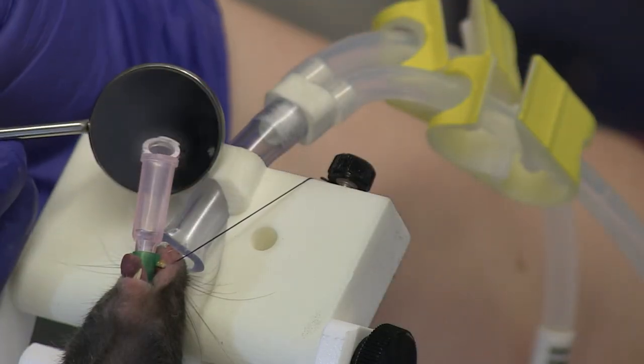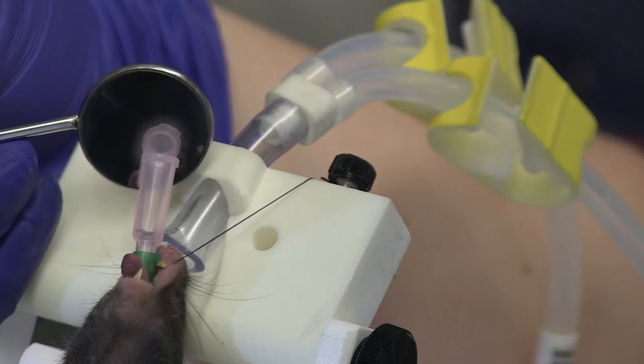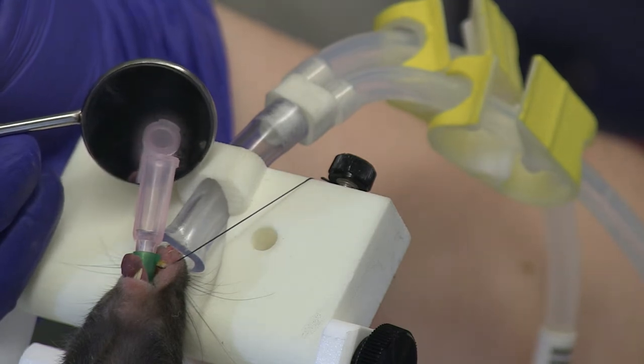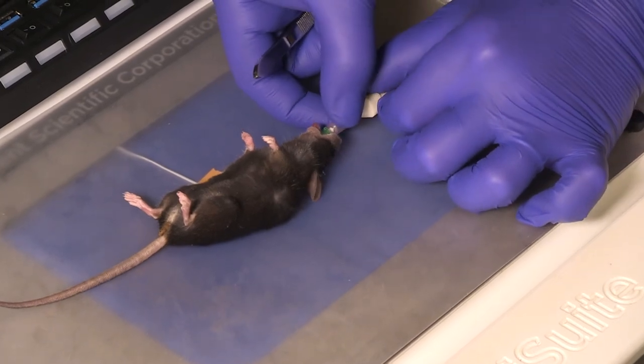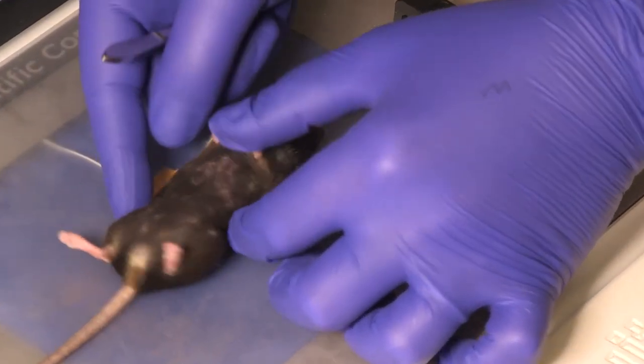Place the included small mirror at the hub of the catheter to confirm correct placement in the trachea. If the animal is successfully intubated, condensation will appear on the mirror as the animal exhales. Once intubation is confirmed, the animal can be moved to the ventilator. Secure the catheter if necessary.